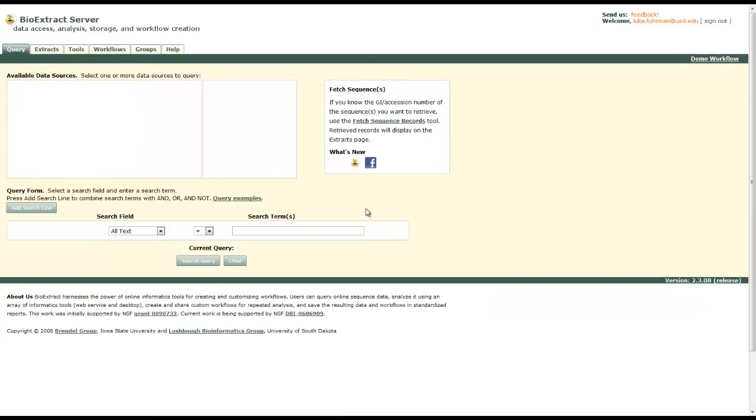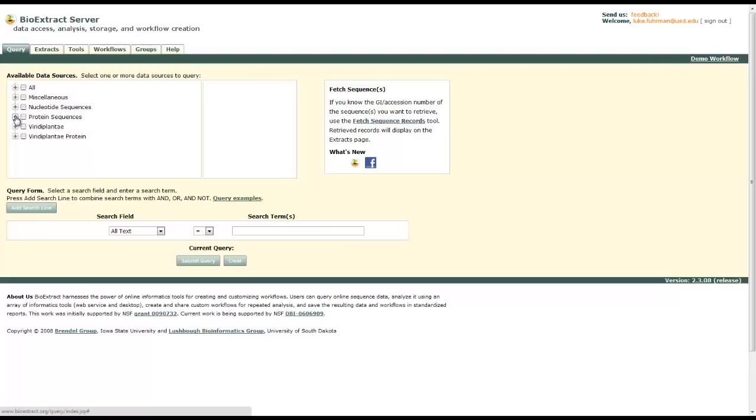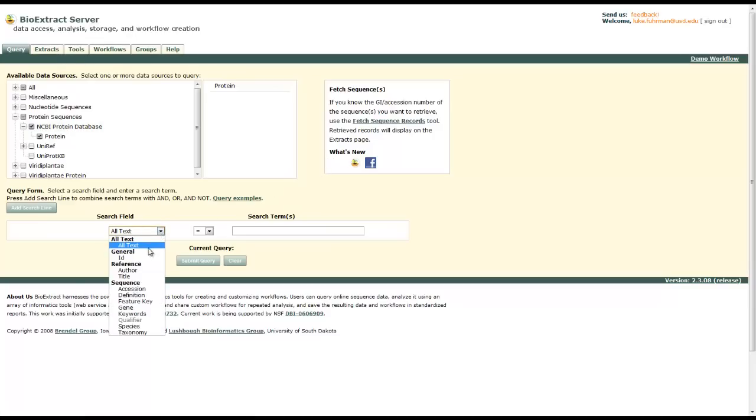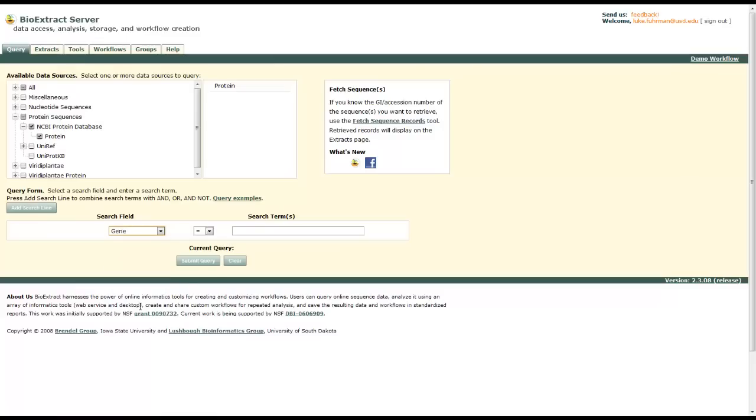Go to the query tab and we're going to search FXN again. In the first section, select NCBI proteins. There we go. Now select gene and FXN. And then we're going to add one more search line to narrow it down a little bit more.